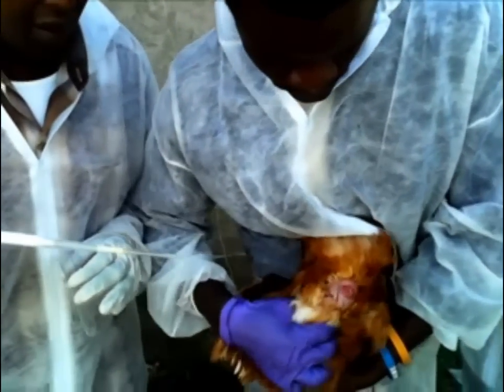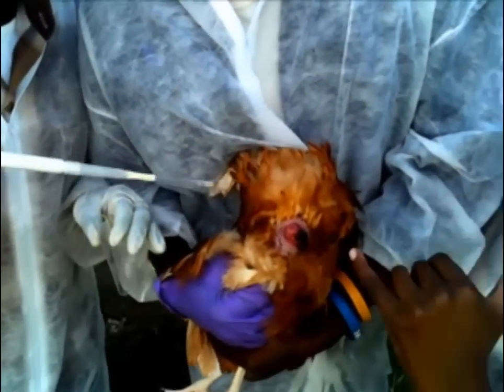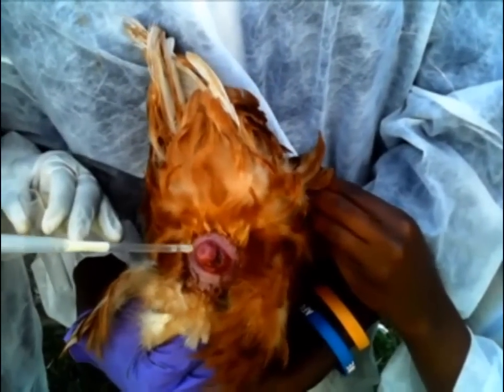This hole here — that's the opening of the vagina, and that's where we're going to deposit the semen.